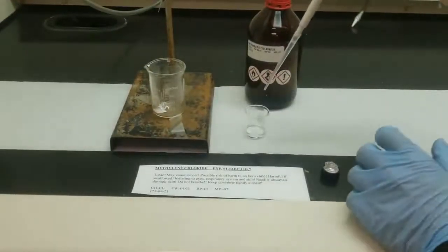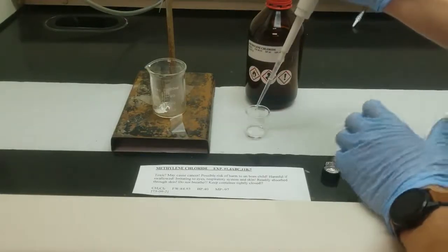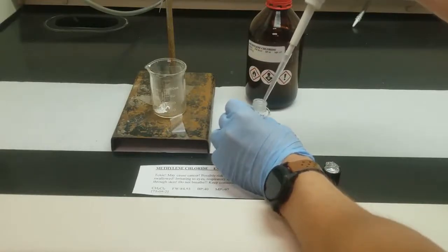So press until the first press. Pick some liquid up. And then add it to your conical vial.